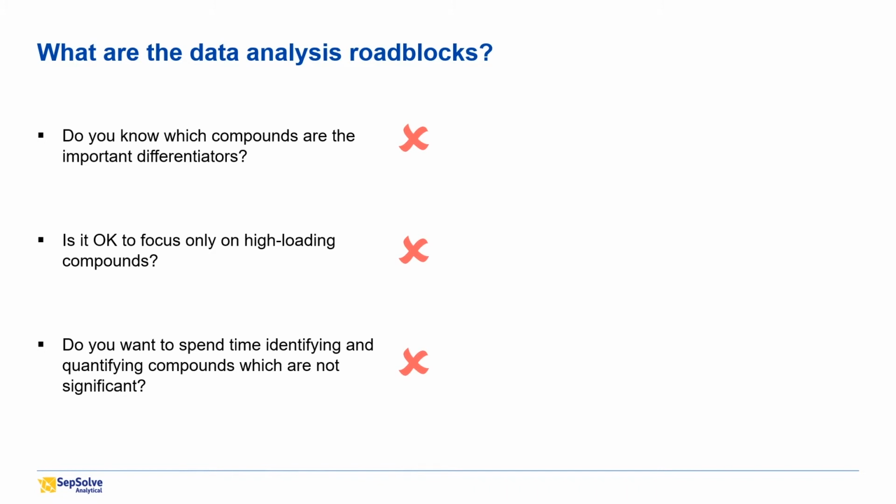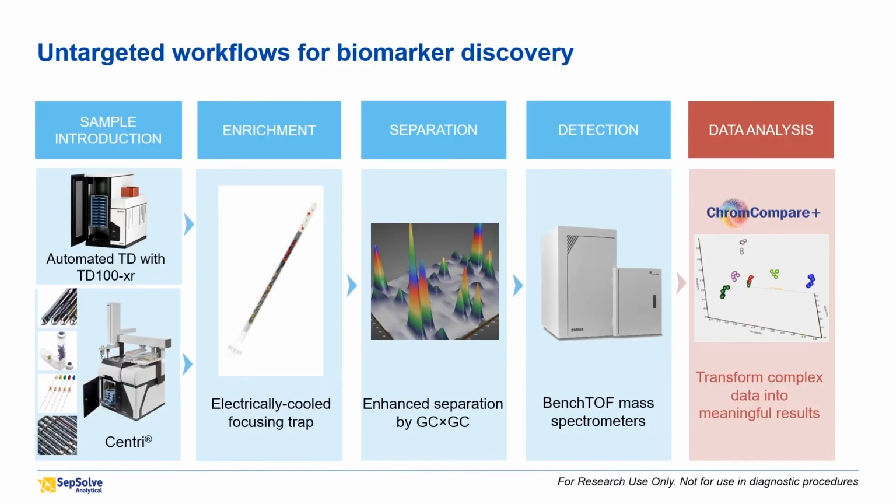So what I'd like to discuss in the remainder of this presentation is the chemometric workflows that we can offer in the new platform ChromCompare+, to tackle untargeted data analysis for both 1D and 2D GC.